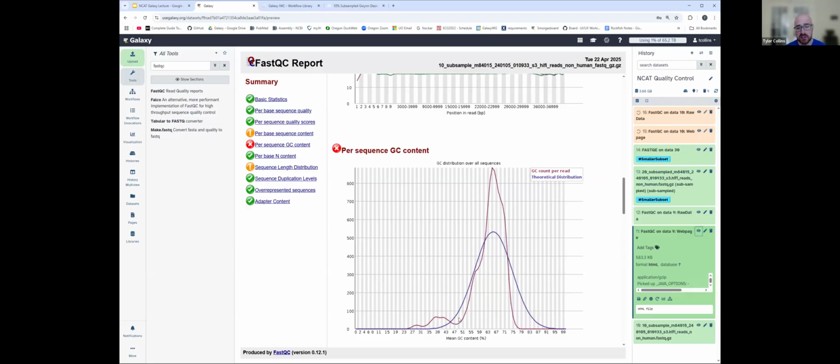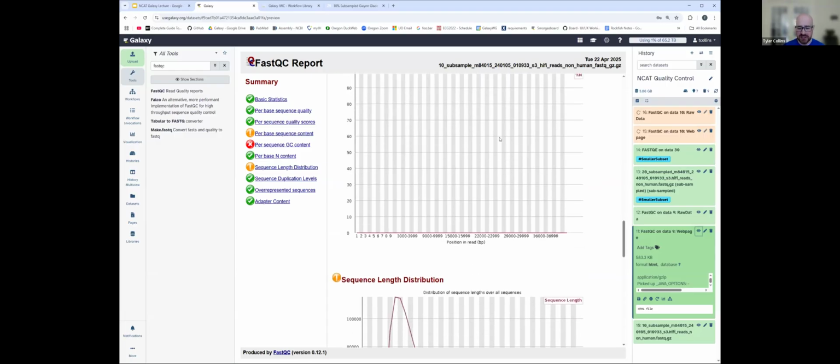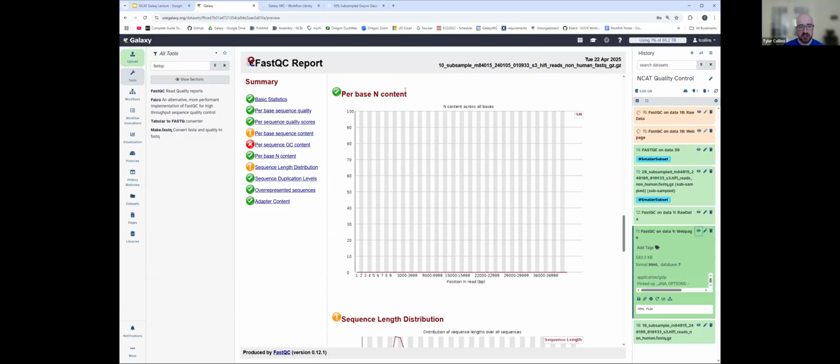It could be something as simple as the extraction method slightly favoring pulling that out as compared to other methods. It could just be true biological variance within the soil, or it could also be something wrong with the extraction protocol or some of the analysis and cleanup that we've done so far. But outside that, the rest of this we'll briefly glance over.